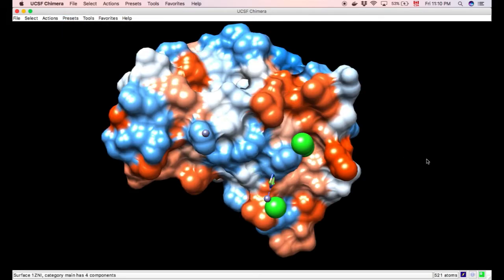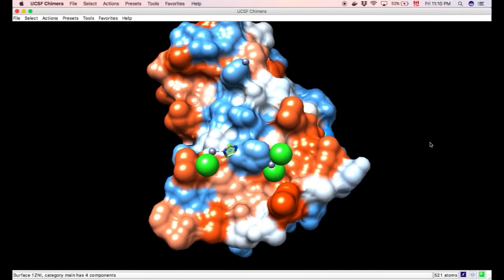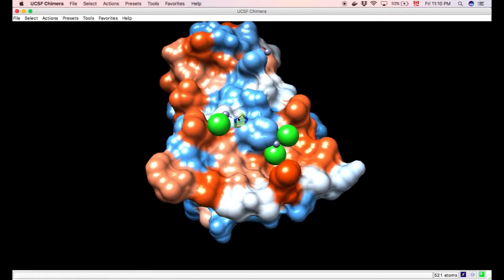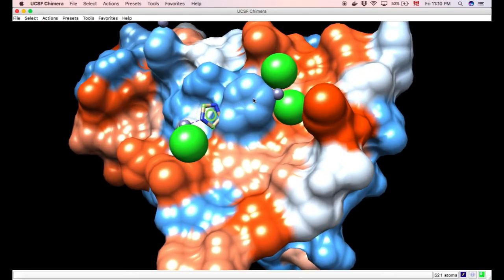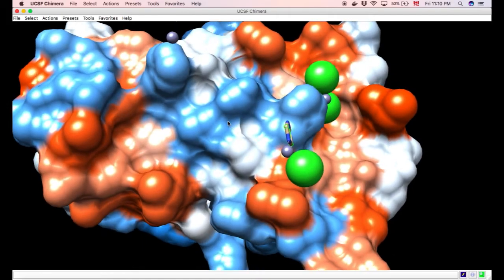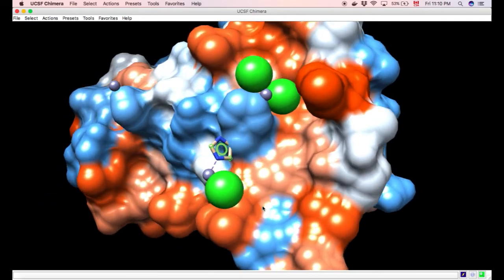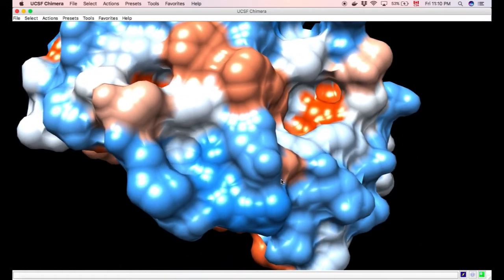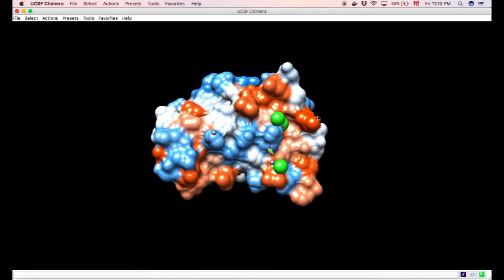There's also hydrophobicity surface, so now it's red for hydrophobic regions and blue for hydrophilic. Right? So here you see it's of course charged. It's actually being binding here. It's actually pretty weird in their work. It seems that this has this conformation right here. It's outside, but maybe an error of Chimera or just an error of the PDB itself. You can watch out for these. First time I actually see this, but you can see the ions are actually nicely fitting. And you can see, oh, probably a good binding pocket right here. So this can be very nice.